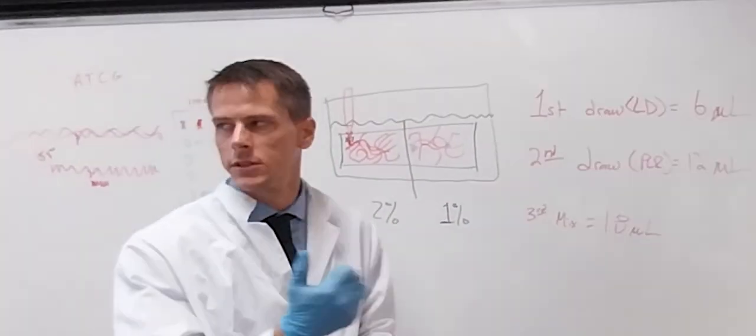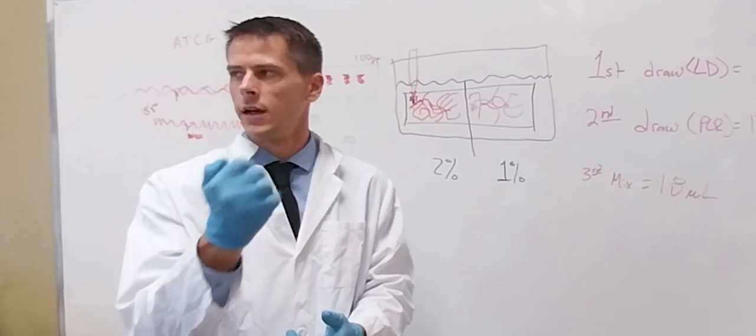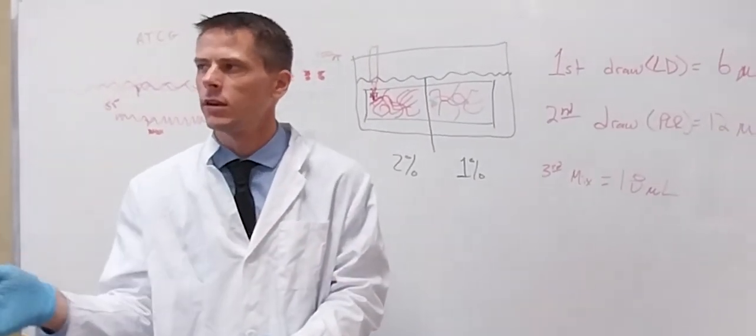Okay, so your first one is going to be at 6 microliters, 6.0, and that's where you're going to do your loading dye. So you put your dots down. I would put down six, 6 microliter dots in a row, so you have your six dots already lined up.